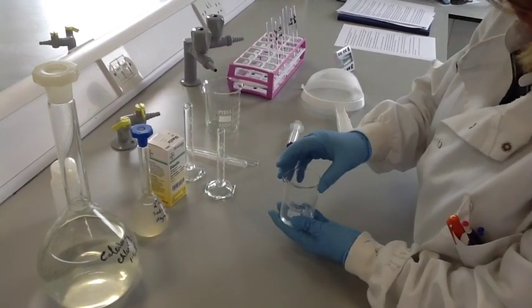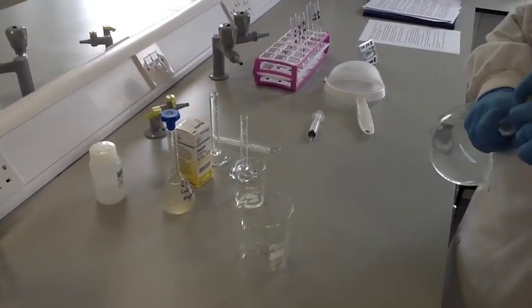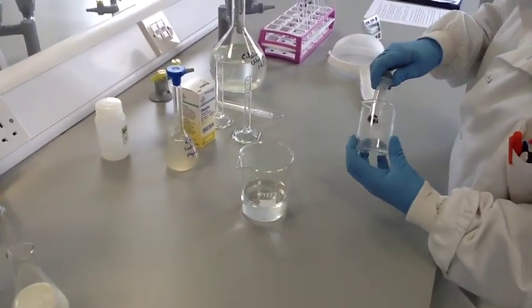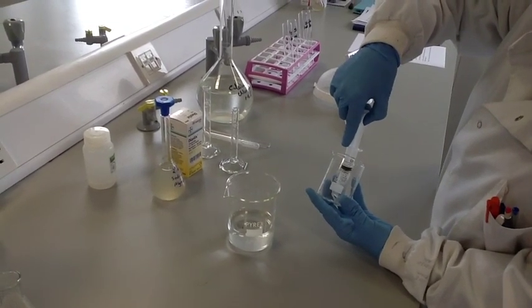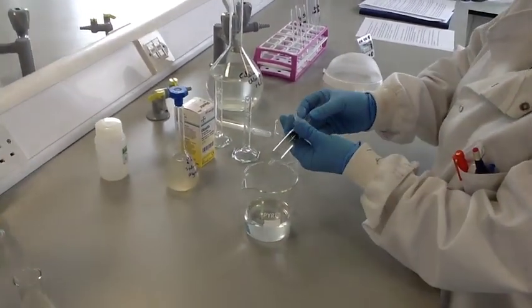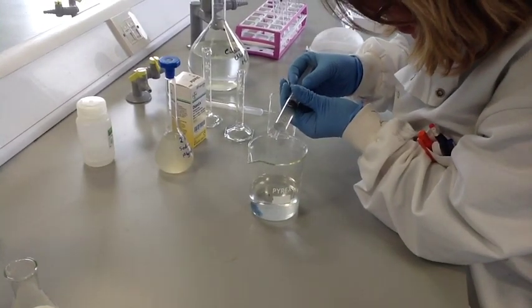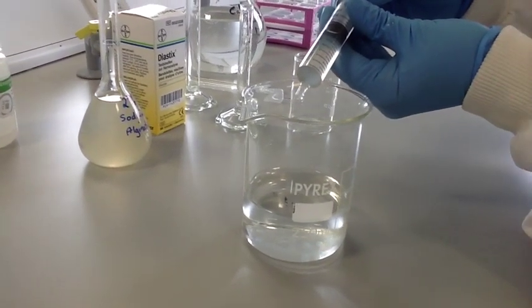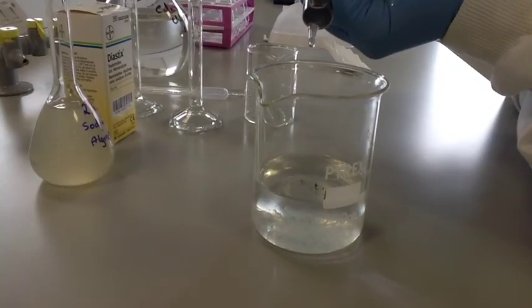Pour 100ml of calcium chloride solution into a 250ml beaker. Draw the enzyme-alginate mixture up into a 10ml syringe and add it to the calcium chloride one drop at a time. When the sodium alginate comes into contact with the calcium chloride, the sodium is replaced by calcium ions which form insoluble calcium alginate. You can see small beads forming — these calcium alginate beads contain the lactase enzyme, so the enzyme has now been immobilised.